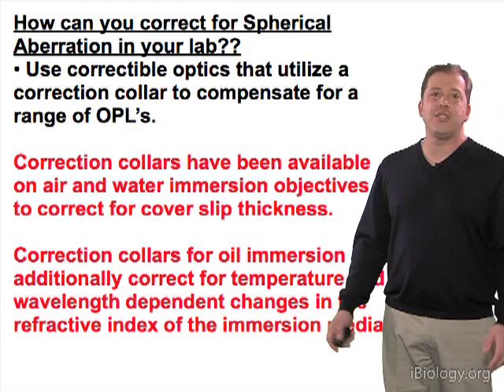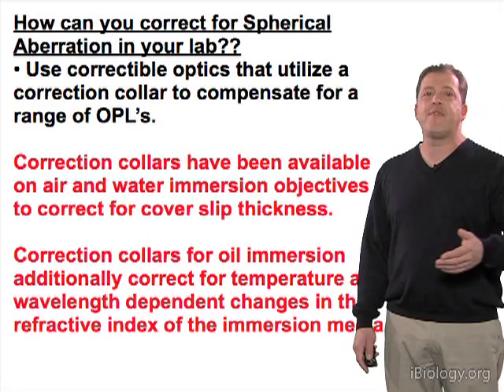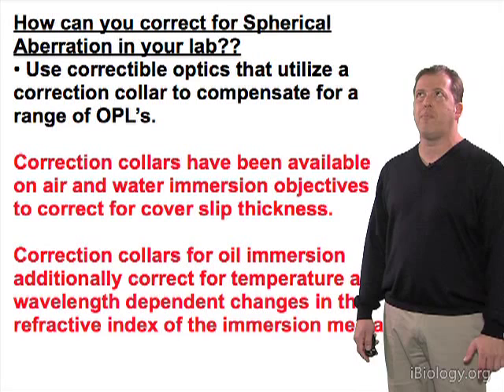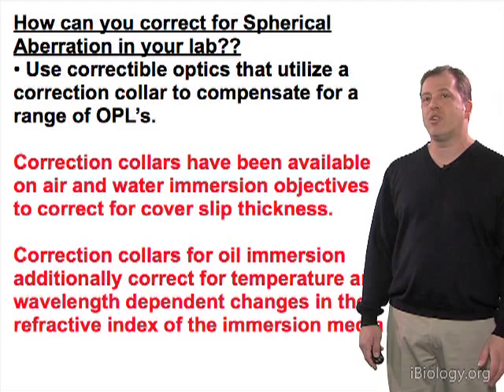Ideally, you'll use a lens with a correction collar, which is really the easiest way to correct for spherical aberration. There are limits, so you have to understand if you're outside the range that can be corrected. A correction collar, traditionally available for cover slip thickness adjustment in air and water immersion lenses, is now also available in oil immersion lenses.